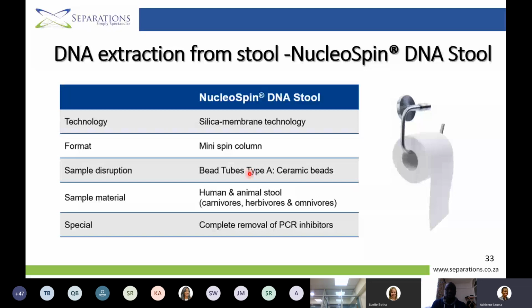So those strategies that we looked at initially for pre-treatment, you can see now that in each of the kits, there is indeed a way integrated into the kits. There are solutions for all of those challenges that we usually get with environmental samples.